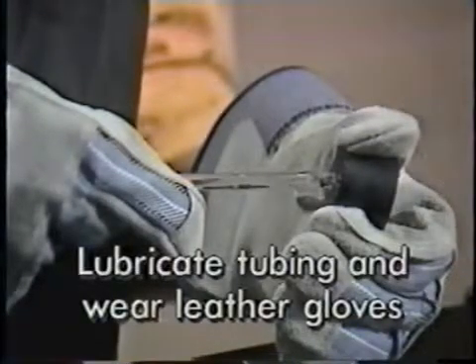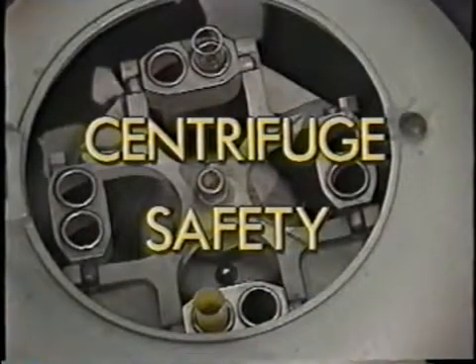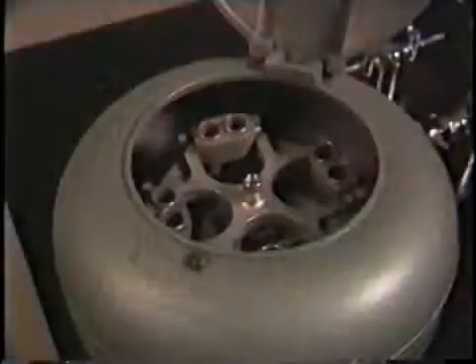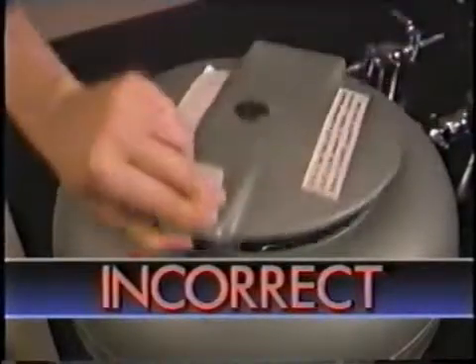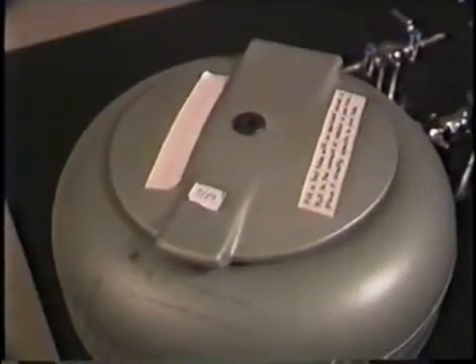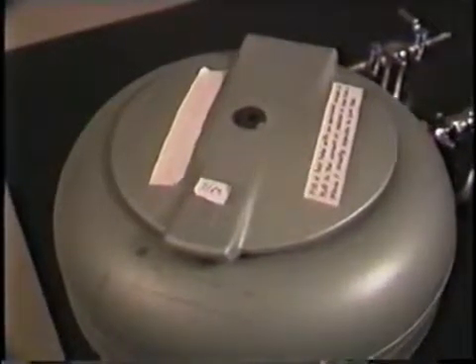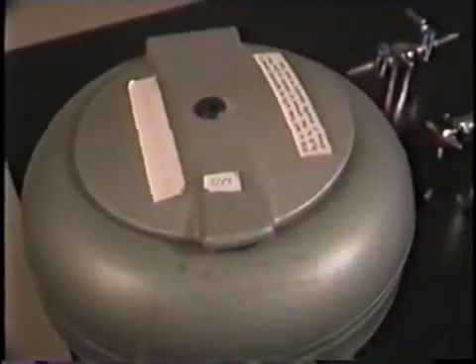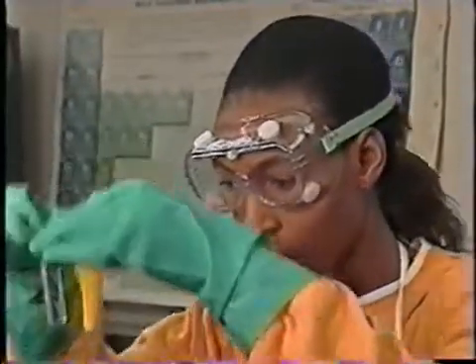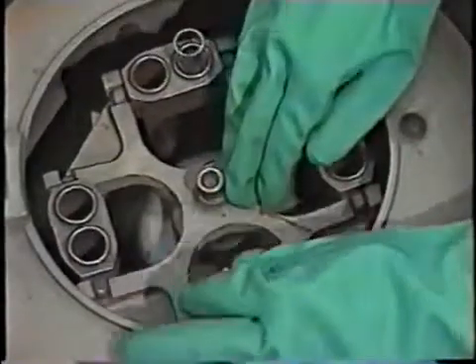A centrifuge spins mixtures in test tubes to separate solids from liquids. The solids move out toward the bottom of the tubes and the liquid stays on top. When the test tubes inside aren't evenly distributed, the centrifuge is unbalanced and vibrates like a washing machine with an unbalanced load. If the vibration is bad enough, it can fall off the benchtop. To prevent vibration, a centrifuge must be balanced. If you're only centrifuging one test tube, place another one opposite it with an equal amount of water.